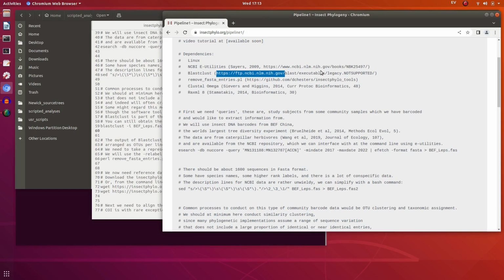Unfortunately this particular software is not being updated at the moment, but it nonetheless is a robust and well written tool and is very permissive to the input data structure.